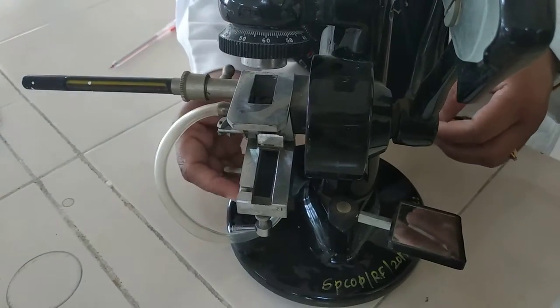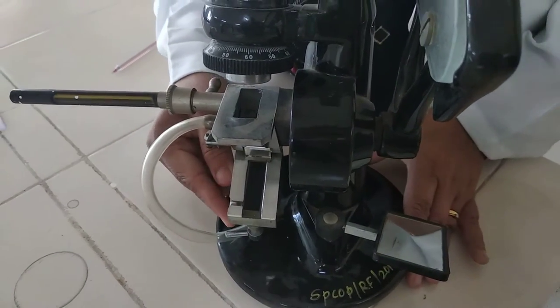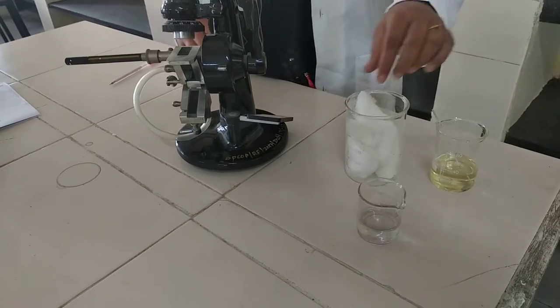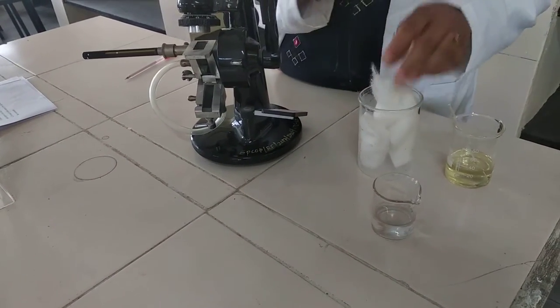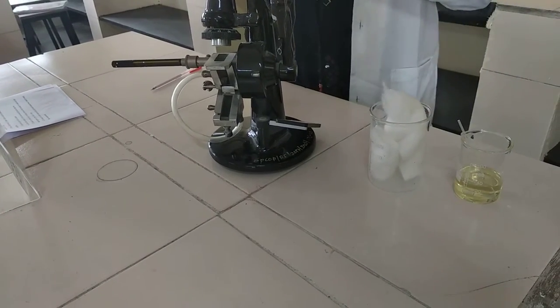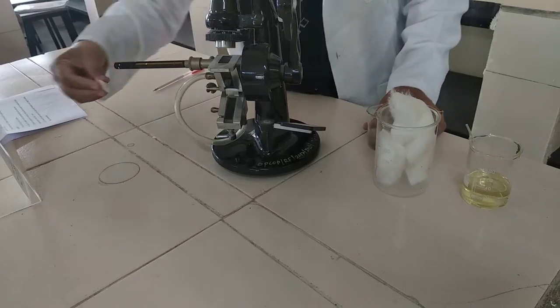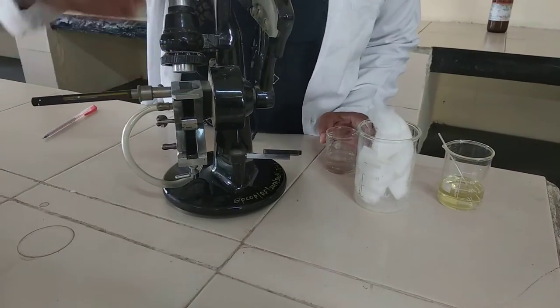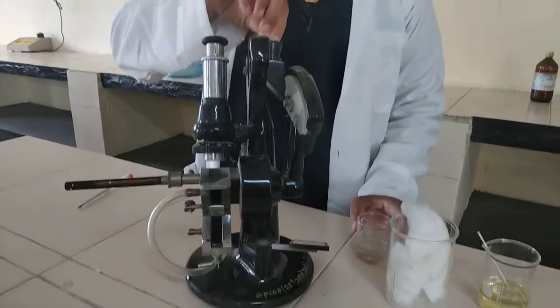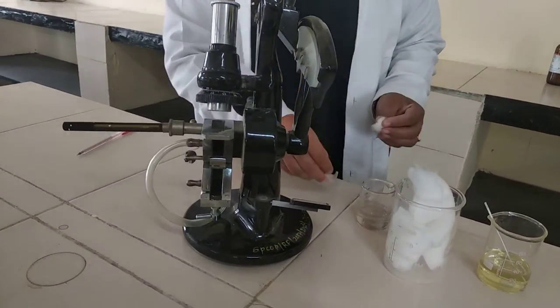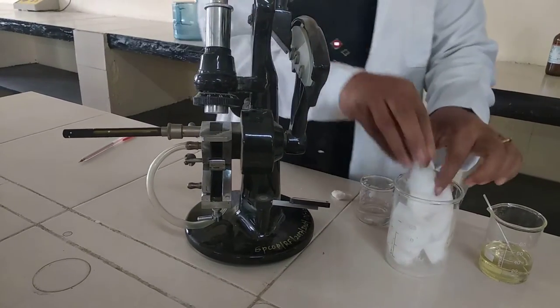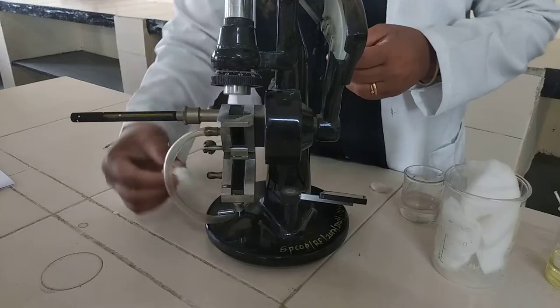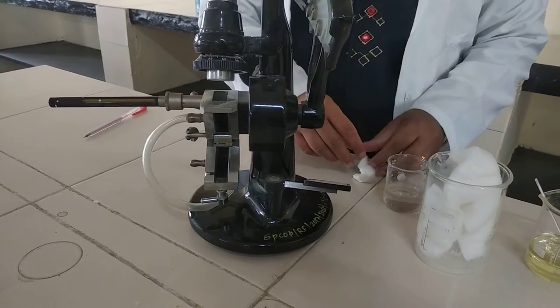Now we will see how to apply the sample. First of all, we have to clean this prism first. First, just take a drop of acetone, then clean the surface of our prism properly. Afterwards, this eyepiece also we have to clean properly. Then dry this prism surface very well. As we have used acetone, so it will become dry easily.